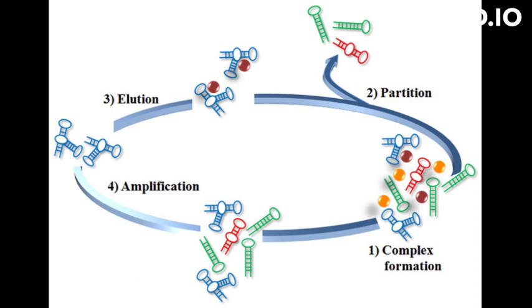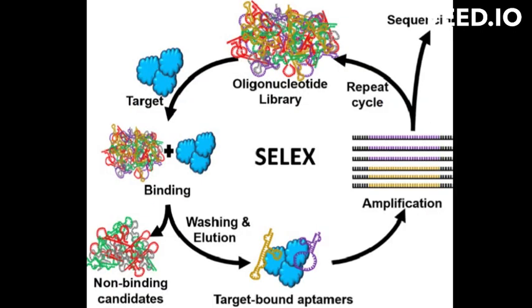sequences of DNA or RNA that bind to a particular target molecule. It is a powerful method that can be used to identify and isolate specific nucleic acid sequences that bind to proteins, small molecules, and other biomolecules.